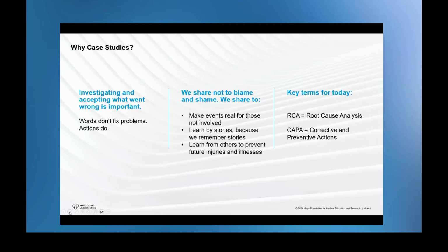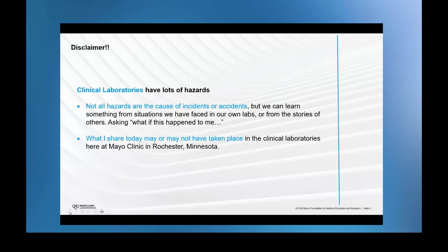But all of that to say, does this mean I'm going to tell you another story about hot water? Is it going to improve your safety culture? The answer is no. But hopefully the stories that I share today will get you thinking about situations and going, I wonder if, or what if this happened to me? And before I leave this slide, I just want to emphasize a couple of terms. RCA stands for root cause analysis, and CAPA is corrective and preventive actions. So keep those in the back of your mind as we move forward.